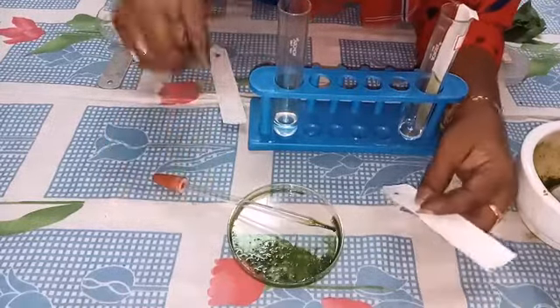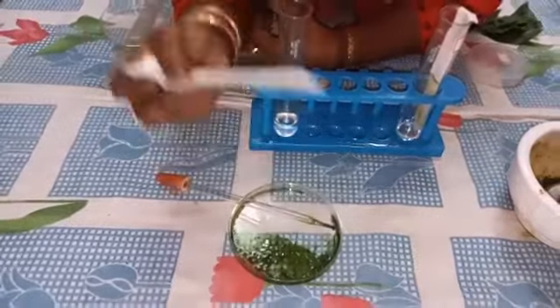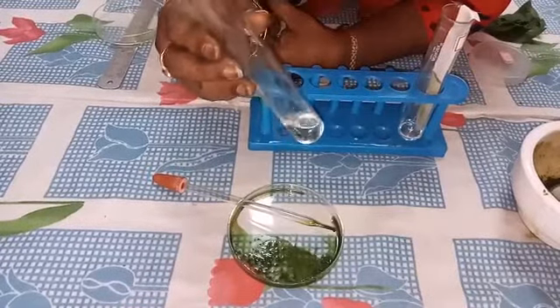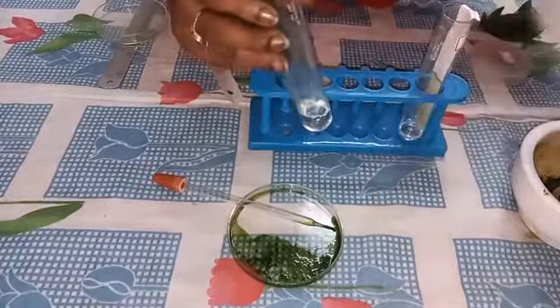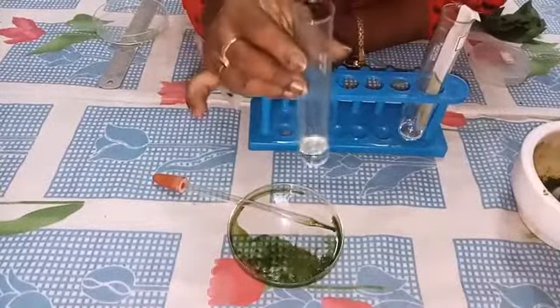After that, we have to dry the paper. When it becomes dry, you have to take the test tube. You have to take petroleum ether and acetone in a 9 to 1 proportion and keep this in the test tube.